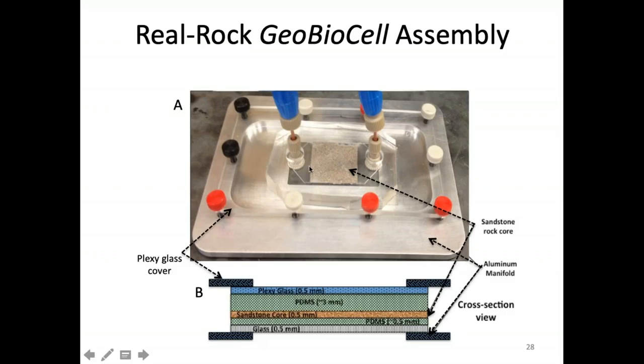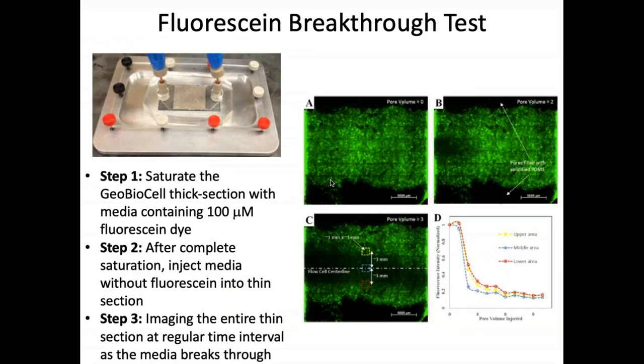We can inject things in here and we can have different designs, two inlets or different things, depending on what we want to do. The idea here is to get the realistic porous media as opposed to what we had before, which is an engineered material and doesn't represent the real subsurface.